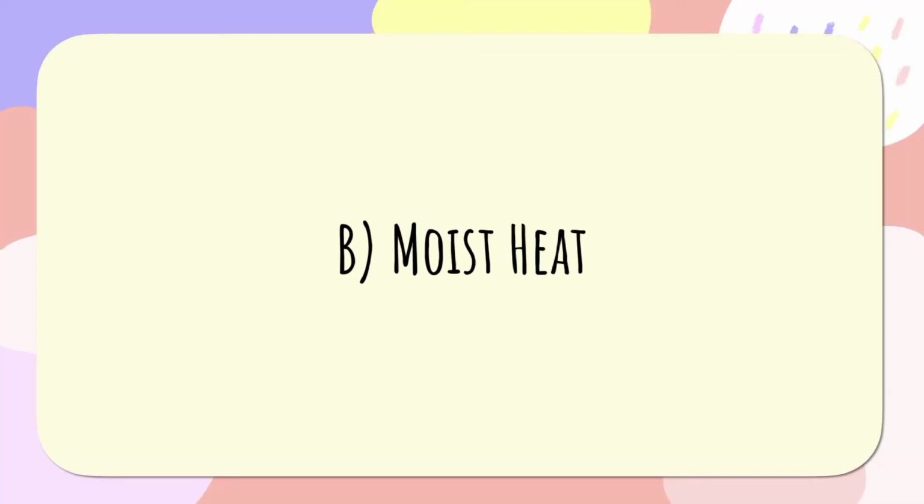Next is moist heat. Moist heat sterilization is used to heated high pressure steam to sterilize the object. Moist heat has better penetrating power than dry heat and at a given temperature produce a faster reduction in the number of living organisms. Steam sterilization is non-toxic, inexpensive, rapidly microbicidal and sporicidal. Moist heat sterilization using autoclave is commonly used for the sterilization of biohazardous trash, heat and moisture resistant materials such as aqueous preparation. Next is air and UV sterilization by using laminar air flow.